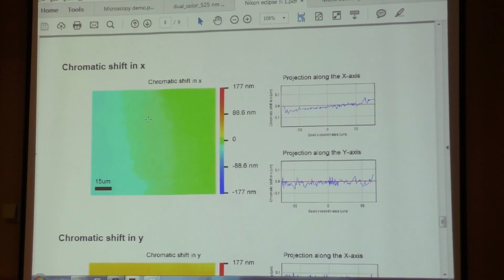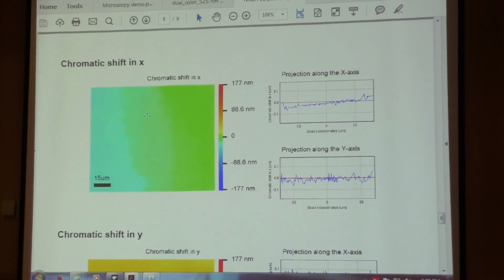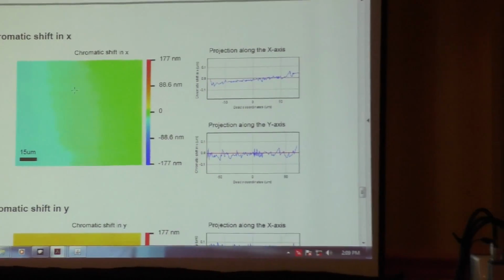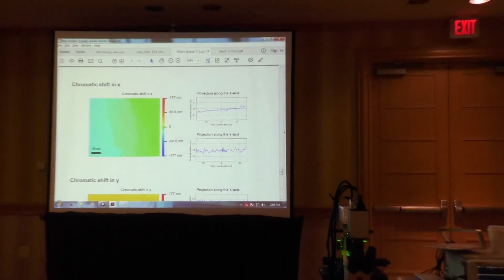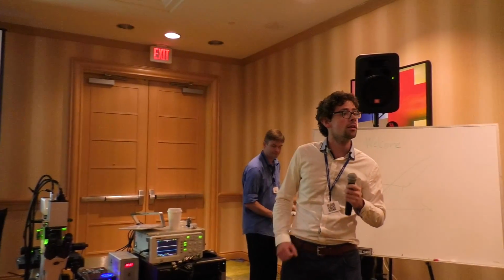So it should take a large amount of the variability away and give you a nice piece of paper to tell your service representative that maybe next time you're going to pay for your microscope service, you want them to do a slightly better job. I guess that's what I have for PSFJ.